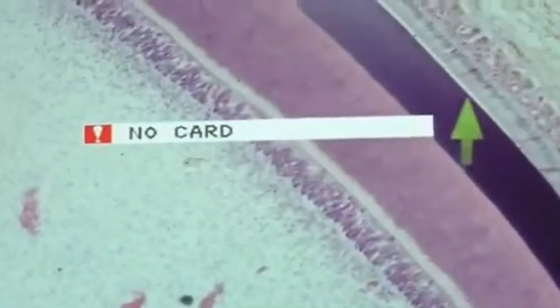So as we follow that enamel down, you can see that that enamel is changing in color. We can see the enamel rods. But you see this enamel is beginning to disappear. And if we go to that surface, we no longer see those pits. This enamel is becoming more and more mineralized. It does not stain as well because the organic material is being withdrawn. So these ameloblasts are in the maturation stage. And as we follow these, pretty soon, that enamel mostly disappears.